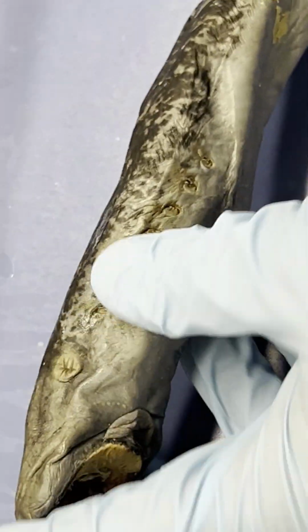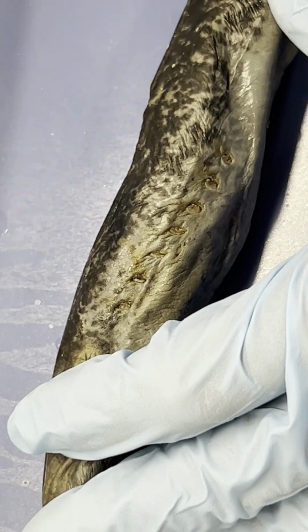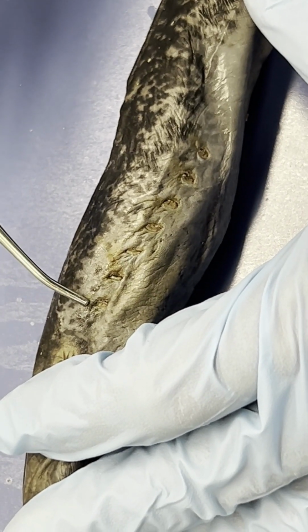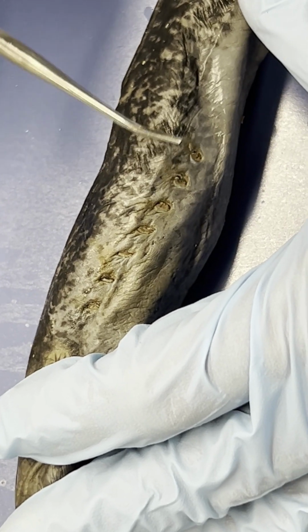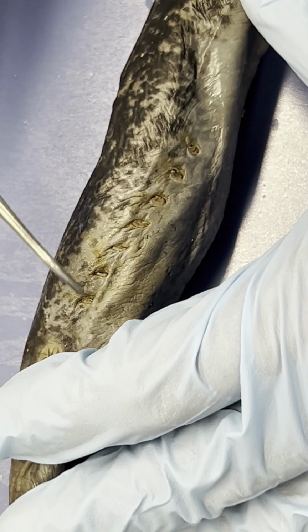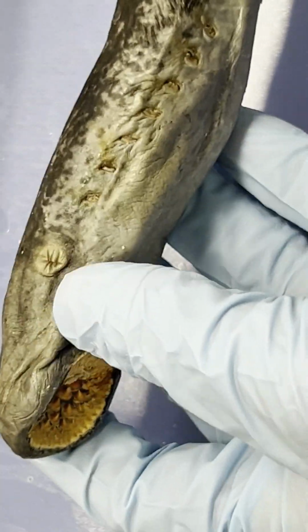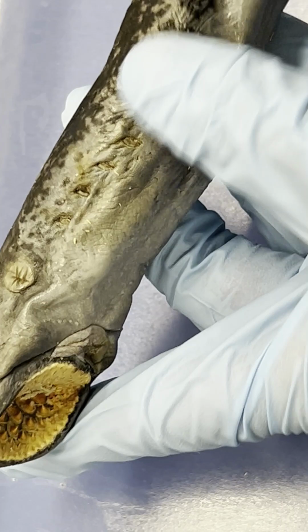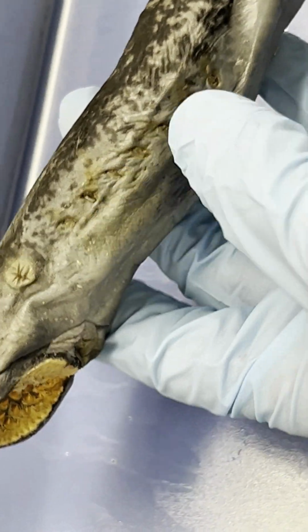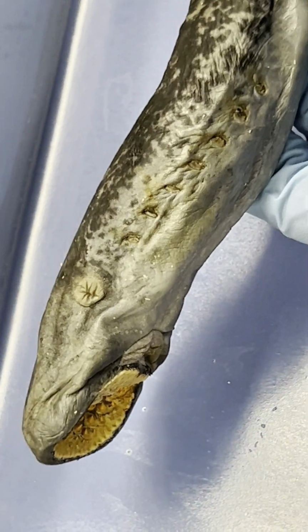They also have gill slits. So these are the external gill slits. We'll be looking at the internal gill slits once we dissect the animal. They should have 7. Let's confirm this. 1, 2, 3, 4, 5, 6, 7 gill slits right there. When folks go to the aquarium and actually see one of these things alive, they actually think it has 8 eyes because they look at each one of these gill slits and think it's an eye. But it's not. Hopefully you guys know that by now.